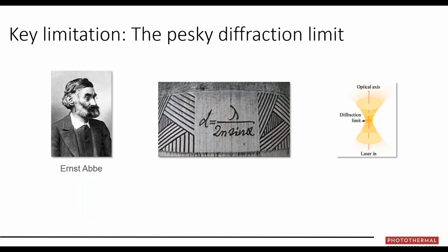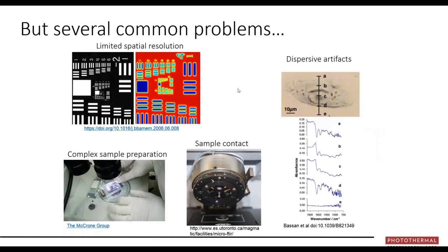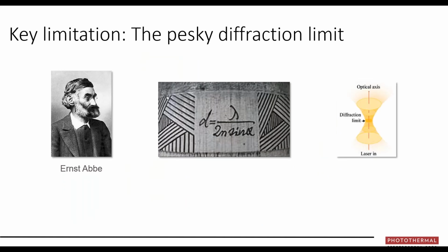Now, the key limitation that we wanted to focus on was the spatial resolution limit of conventional IR, and there is a fundamental limit in conventional optical microscopy called the diffraction limit, described by this gentleman, Ernst Abbe, that says that the smallest that you can focus light, that waist here, is going to be set by the wavelength of light and the index of refraction, and then the cone angle here of the light. Well, there are practical limitations to how big you can make that cone angle, and the fact that we're using infrared light with wavelengths 10 times or more bigger than visible light means that we can't focus that spot to as small as we would like, and that's what leads to the fuzziness in these images that you see here. So that optical diffraction has been a fundamental limit of infrared microspectroscopy.